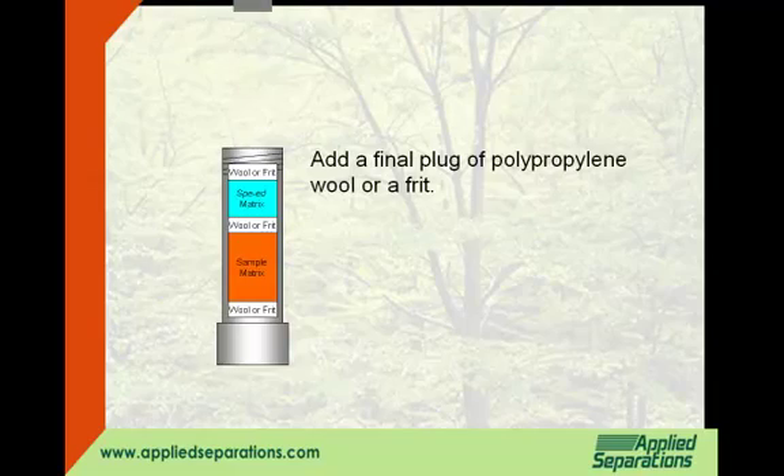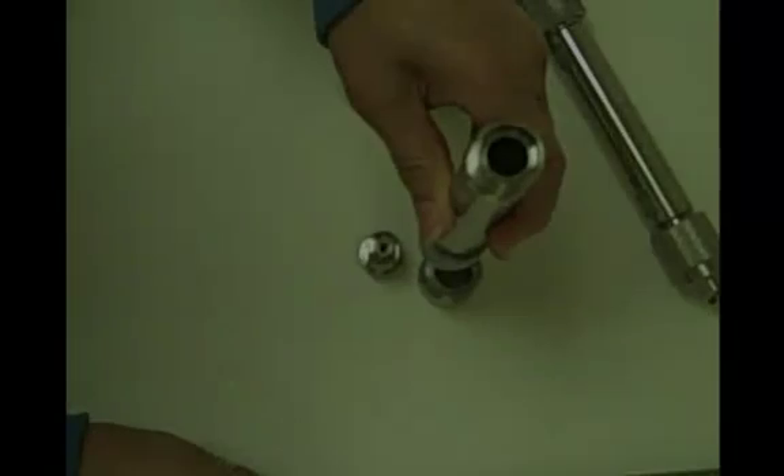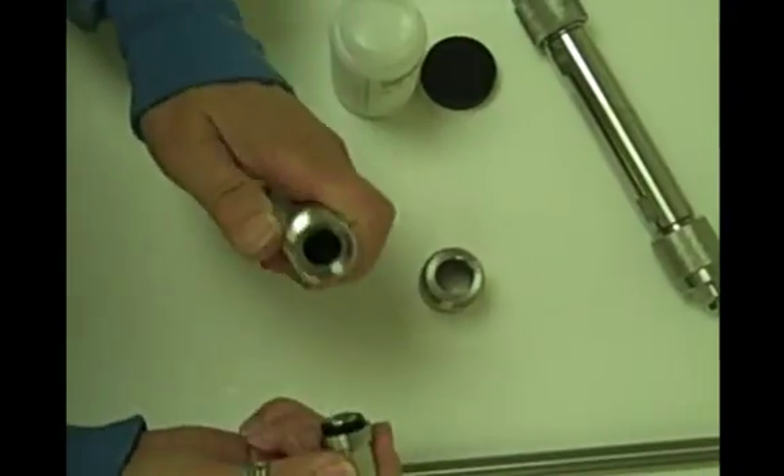Add a tiny O-ring to the end fitting. Replace and tighten the end fitting.